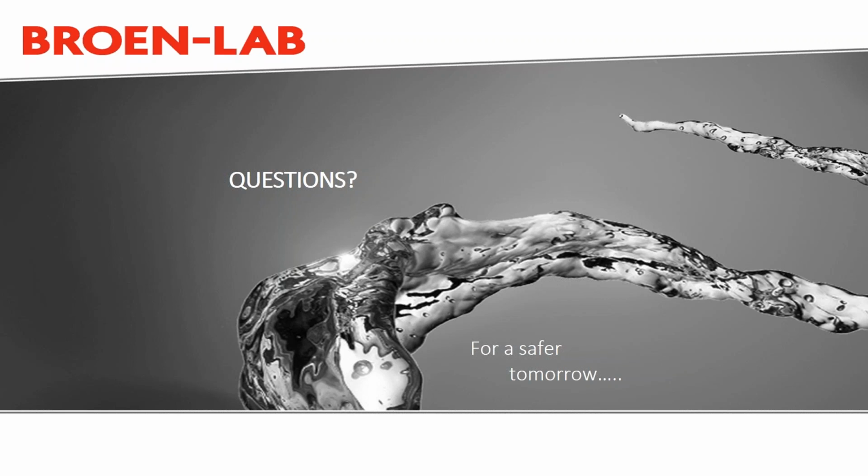And the other issue with floor drains is sloping to them, which often causes problems for cart traffic in labs. If you have a slope to a drain, it can cause big problems with large volumes of sample movement in labs. But that said, correct me if I'm wrong, Rick, it does become an institutional preference. Correct. At every single campus I work on, it's the discussion of floor drains or no floor drains, but I see the market trending to no floor drains in these new facilities. Right.